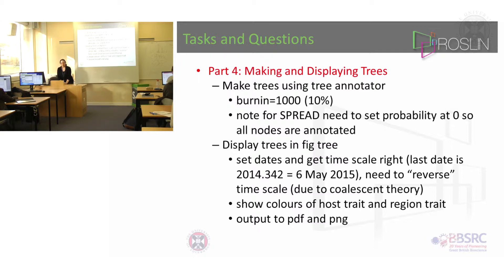Then you should display your tree in FigTree. It's quite easy to open trees in FigTree, but there are other settings to put the time scale on it. The important thing to notice is what the last date is, because you have to set that in FigTree. This date here — 2014.342, which is actually the 6th of May — and because of coalescent theory you have to reverse the time scales. I'll show you how to do that.